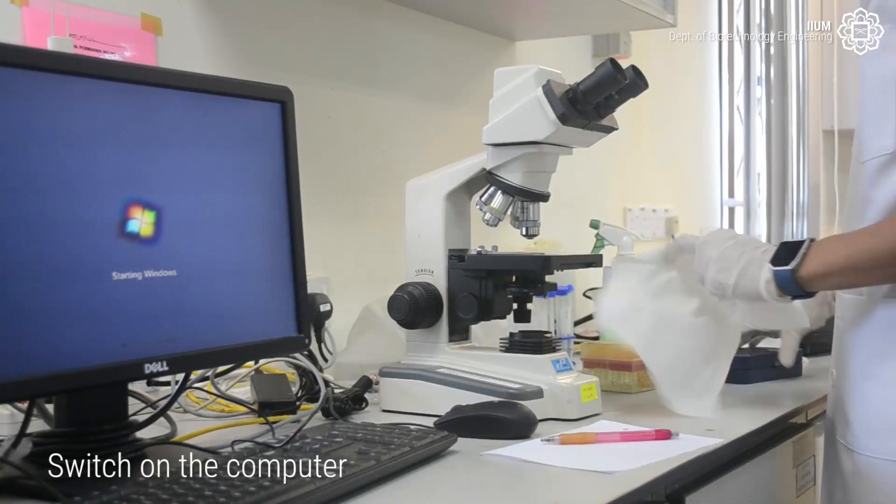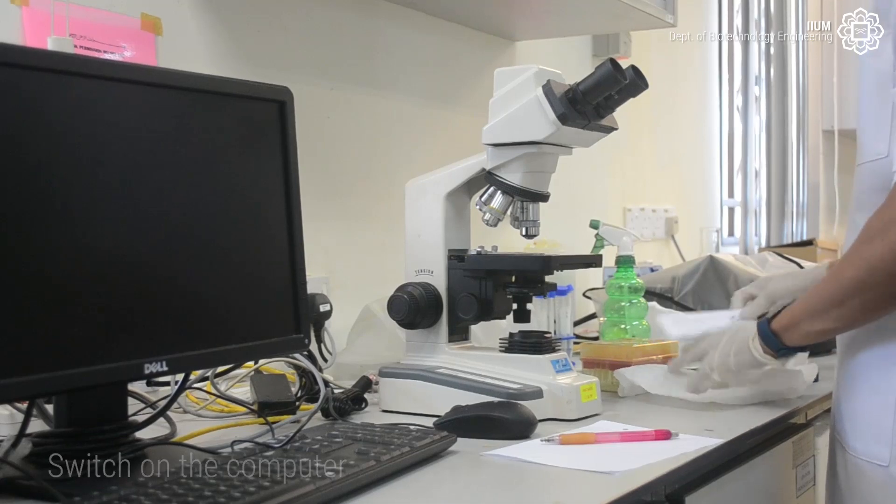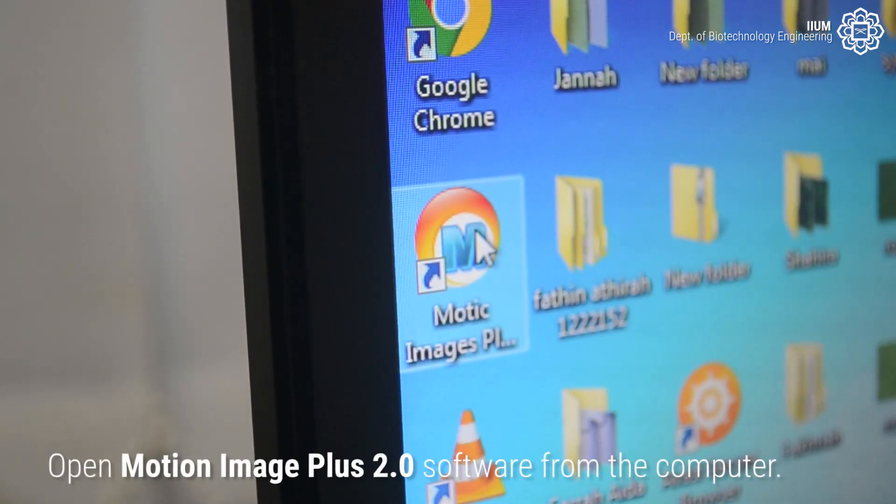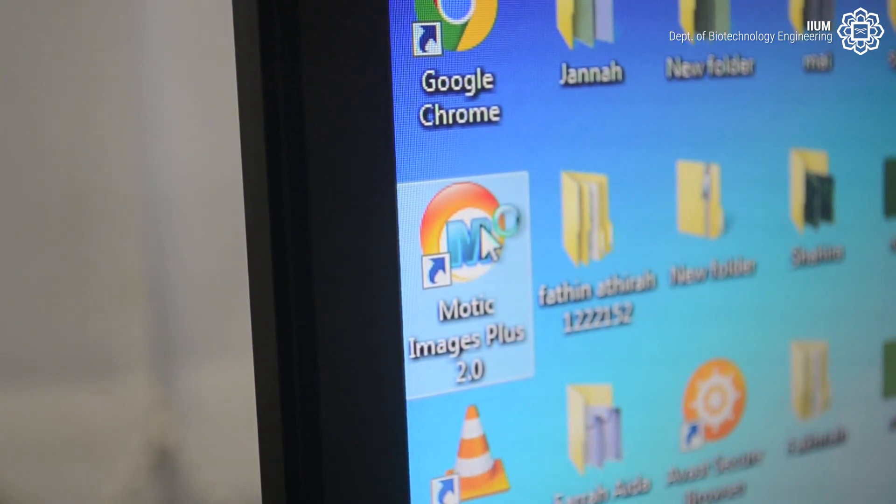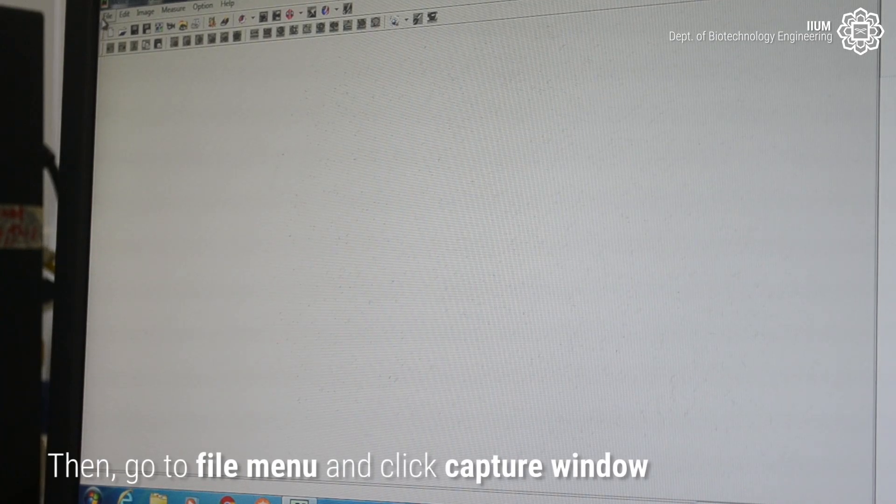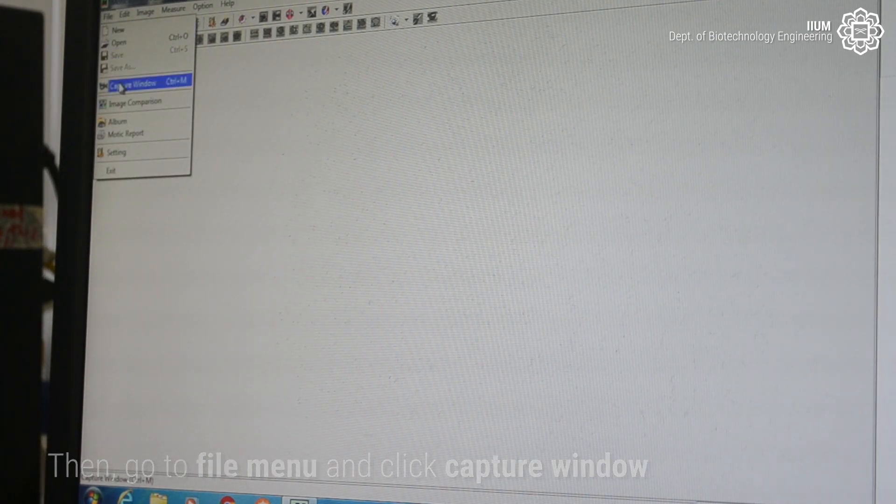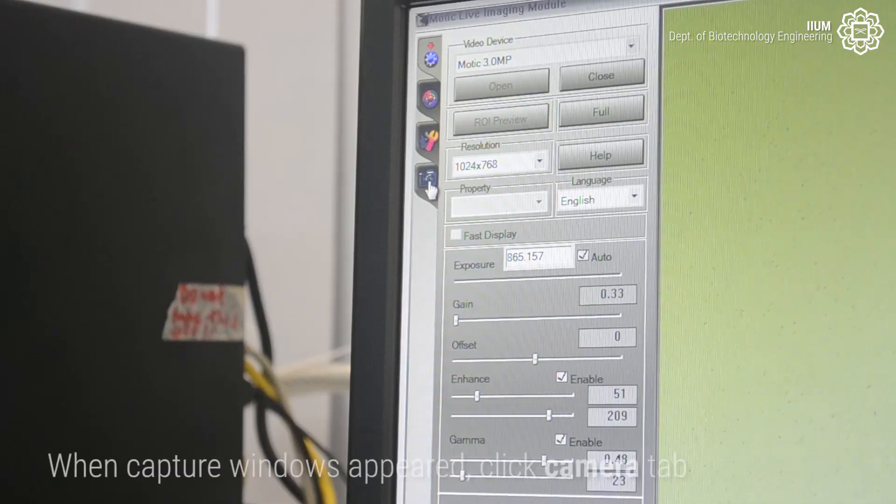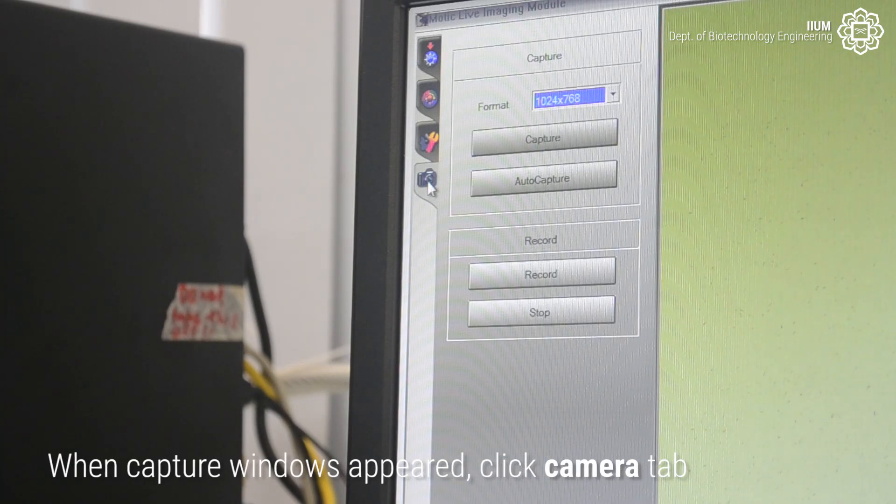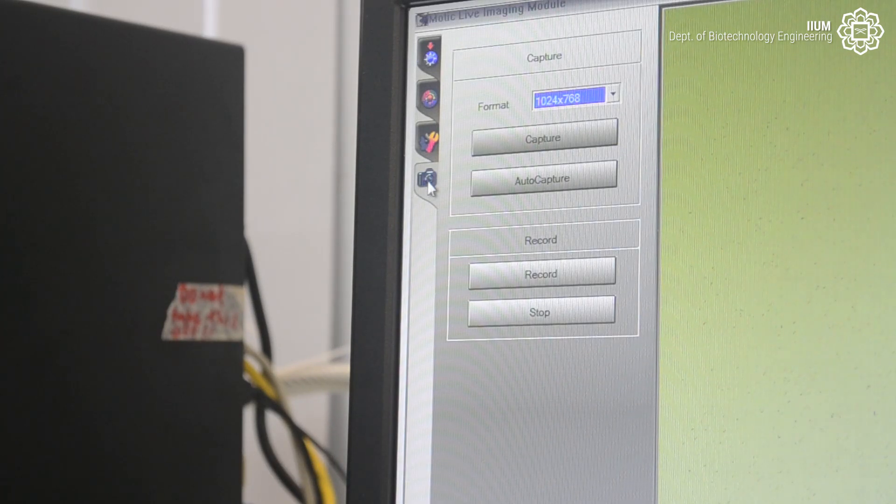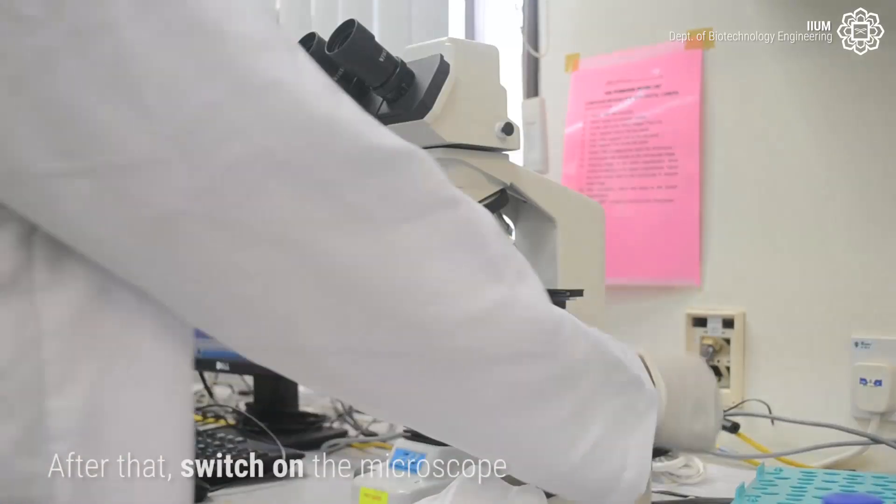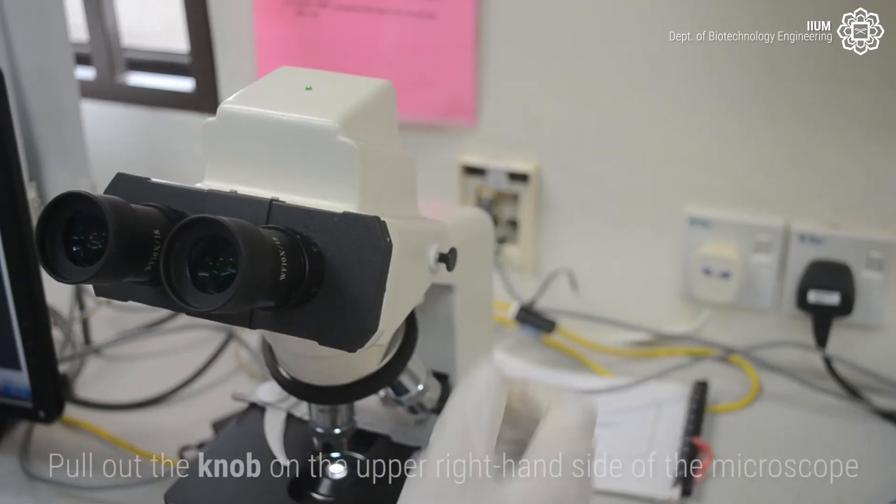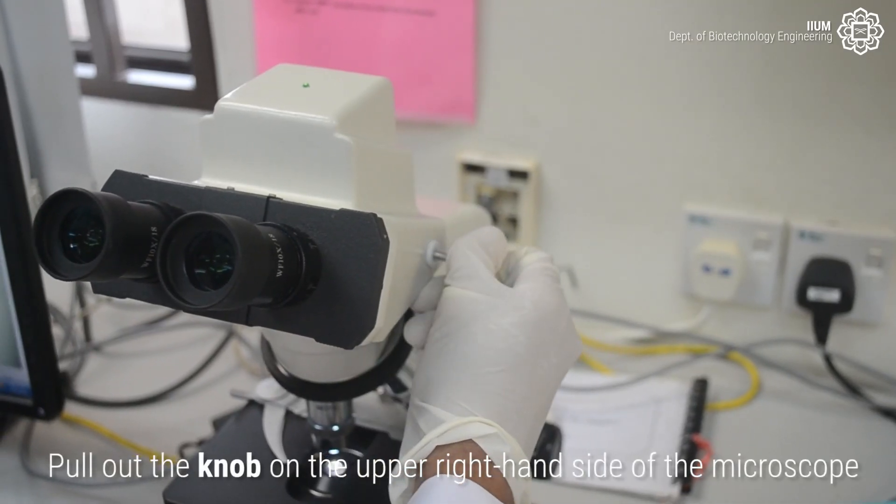Switch on the computer. Open MotionImage Plus 2.0 software from the computer. Then go to File menu and click Capture Windows. When Capture Windows appeared, click Camera tabs. After that, switch on the microscope. Pull out the knob on the upper right-hand side of the microscope.